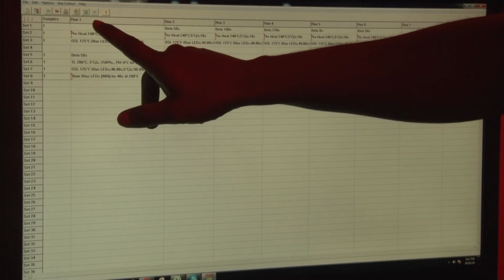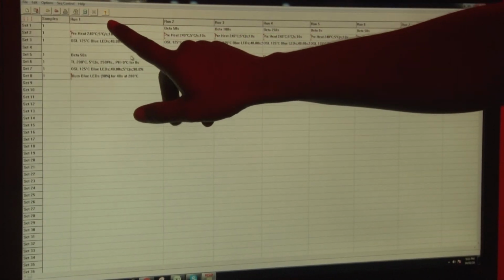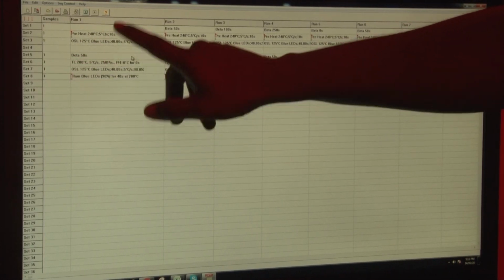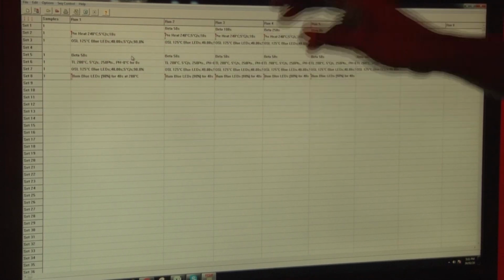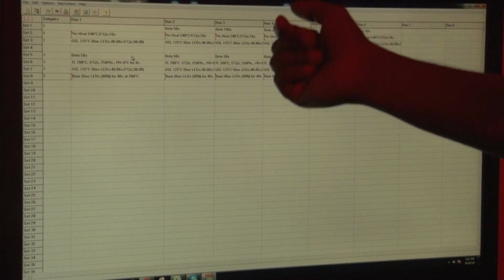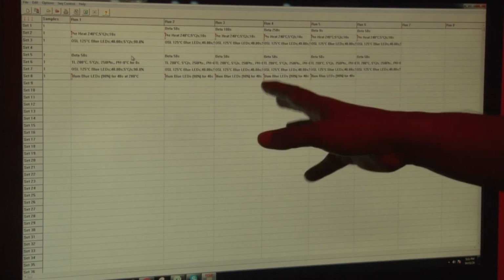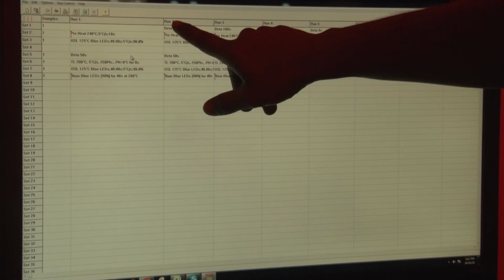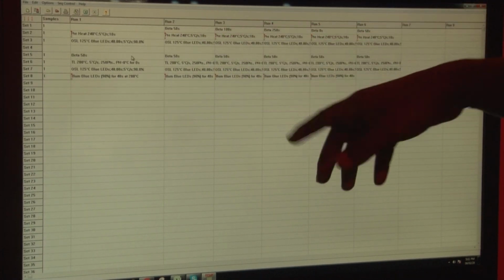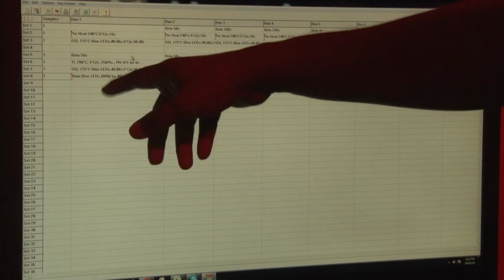So we will calculate the Lx by the Tx. That is the luminescence in the natural sample and the test dose in the sample. We will divide them for each run, and we will see what changes are happening in the sample. That procedure is called the sensitivity correction. From run 2, this is all the laboratory procedure which is assigned to regenerate the dose which we are getting in the natural sample.